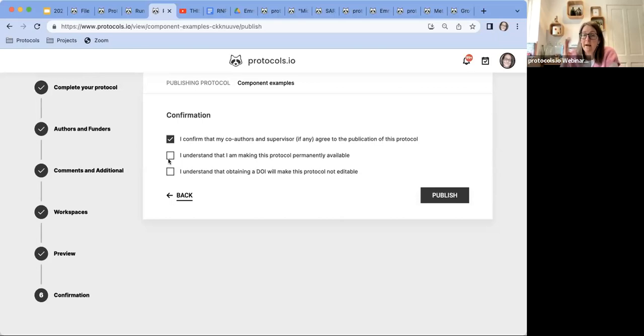You get the DOI, this is published, it gets sent, we're starting to be indexed by Google Scholar, and your PMC is coming soon. It's a formal thing. It will go to Crossref. If you've linked with ORCID, it will appear on your ORCID profile. People sometimes don't seem to get that this is as formal a publication as other things.